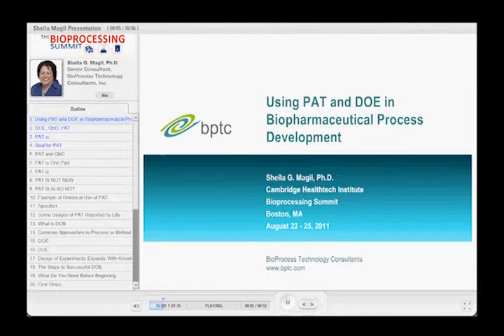Joyce and others have both talked at a very high level about QBD and operational excellence. What I'm going to speak about now is somewhat of a step down. PAT and DOE are things which support QBD and operational excellence. The talk is pretty much in two halves, PAT discussed first and DOE discussed second.